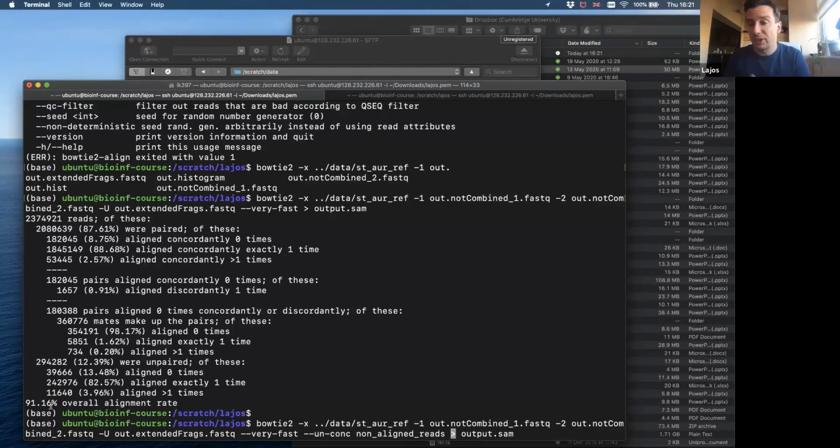Sometimes there is a two-fold difference, but not often. They are usually between 2 and 5 megabases. So if your alignment rate is 2%, that probably means your genome was represented in about 2% of all the DNA.